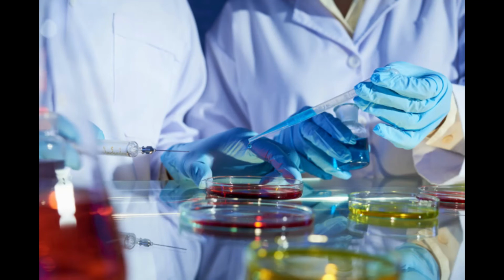So when y'all write up your lab, and you're looking for that procedure in here to copy into your own lab report, there's the broth to broth. What page is that? Just 35, sorry, 35. And you got the picture diagram there, or you actually have a written out one on page 34, whichever you prefer.